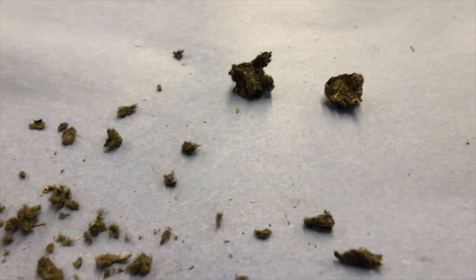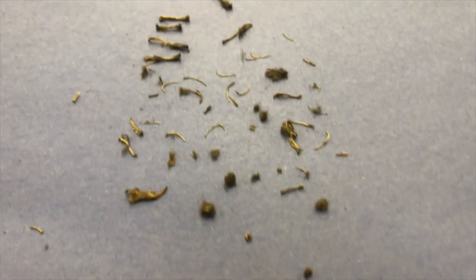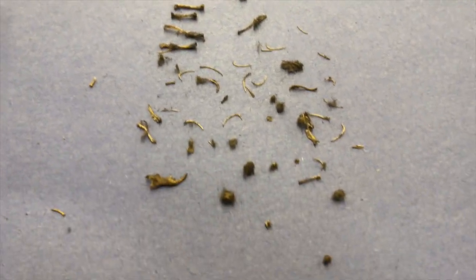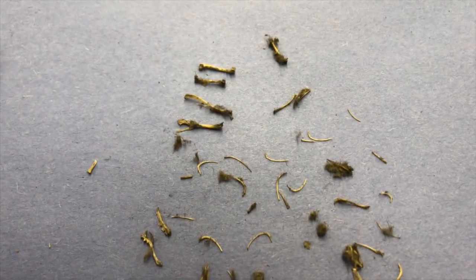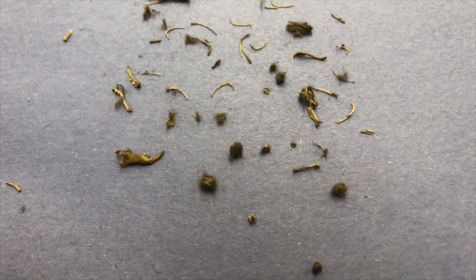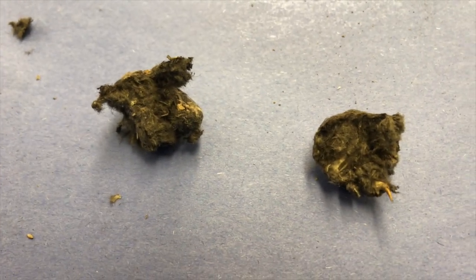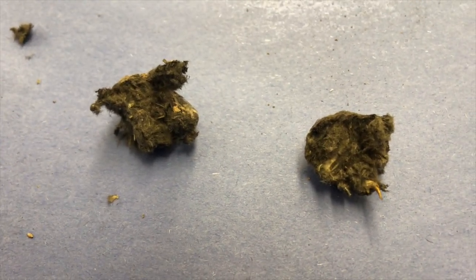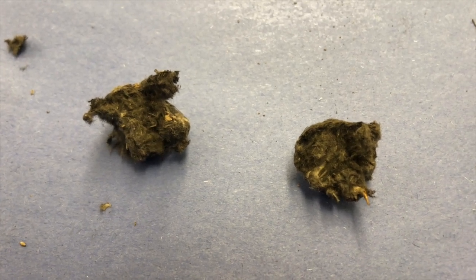I have been working for about 15 minutes, so I've got all of this fur that I've taken apart, and these are the bones that I have set aside. So I haven't organized them yet. I'm just kind of setting all of my bones to one section of my paper, and I still have these two pieces to go. I have not found a skull yet, so I'm hoping that I'll be able to find one shortly.